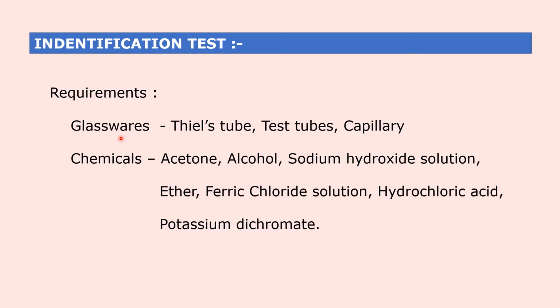Requirements: glasswares you require Thiel's tube, test tube, capillary, etc. In chemicals, acetone, alcohol, sodium hydroxide solution, ether, ferric chloride solution, hydrochloric acid, and potassium dichromate.